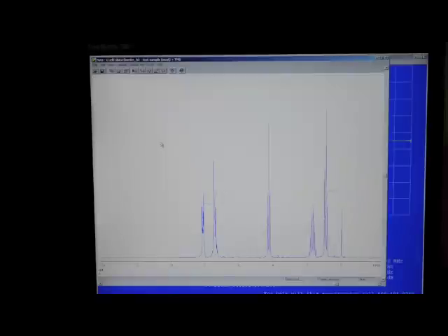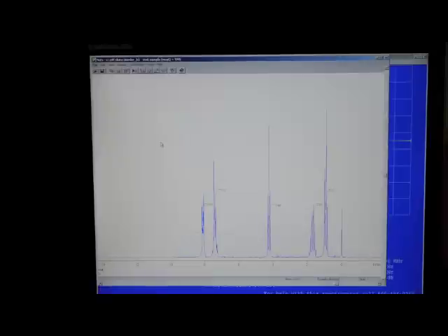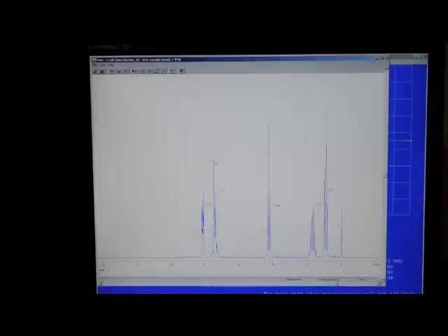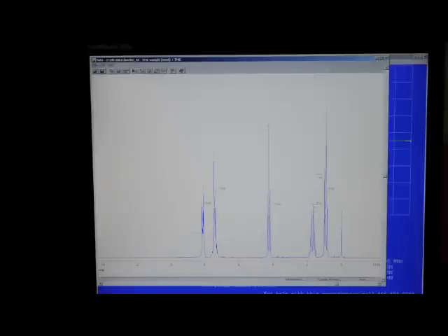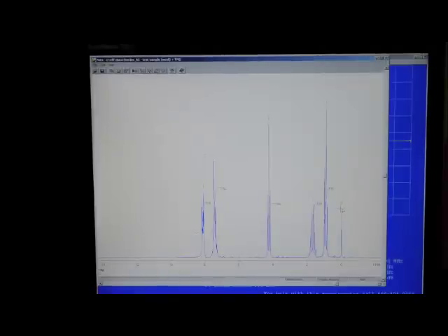Hold down the CTRL key and press I to display the integrals. Type DP to pick the peaks. Click on each peak for which you would like to have the chemical shift value. I suggest including the TMS peak so that you can be sure that this peak is actually at zero parts per million. Press ENTER to leave the peak picking routine.